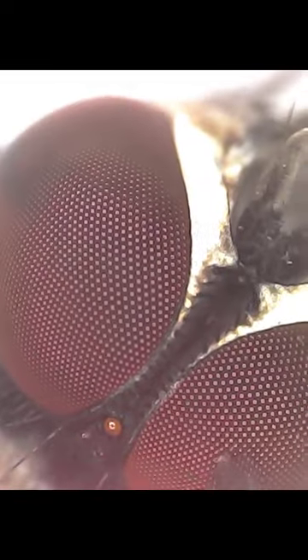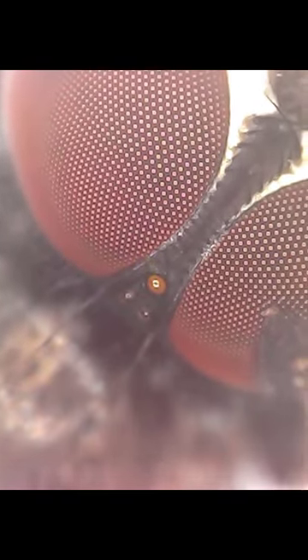We are going to watch a housefly with a USB microscope. They are telling it has 500x and 1600x magnification possible using this, but according to me that is after analyzing various things using this, including mosquito.